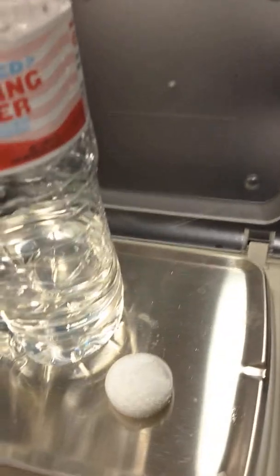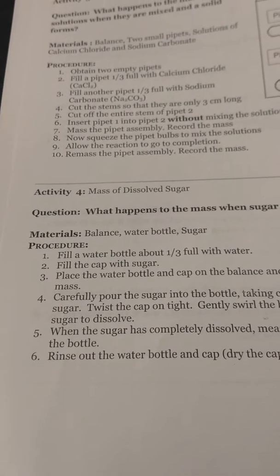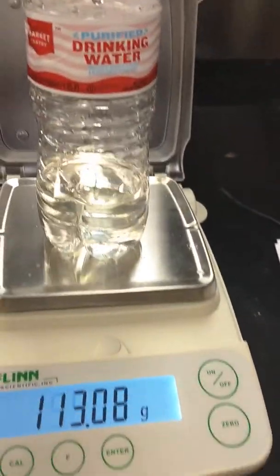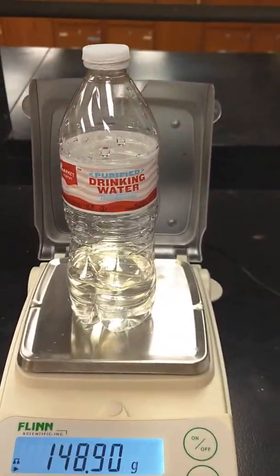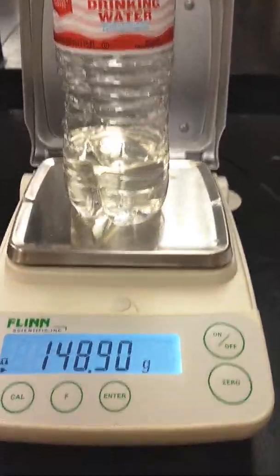Now it's going to ask me to put the sugar into the water bottle, put the cap on, shake it so that there's a reaction, and then put it back on the scale. I've added the sugar into the water and I'm trying to get it to dissolve. The sugar is inside the bottle now — I mixed it, the cap is on, and this is the new mass.